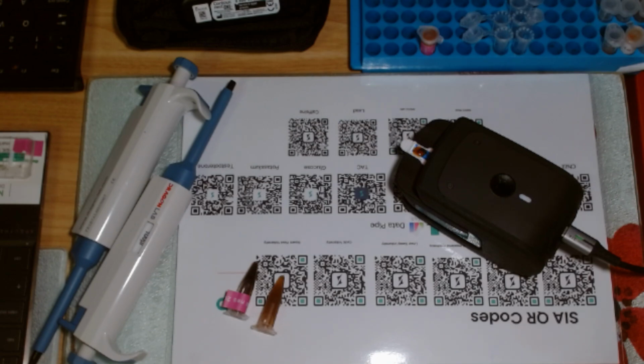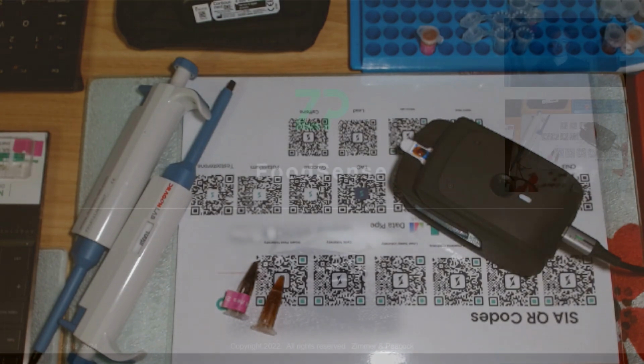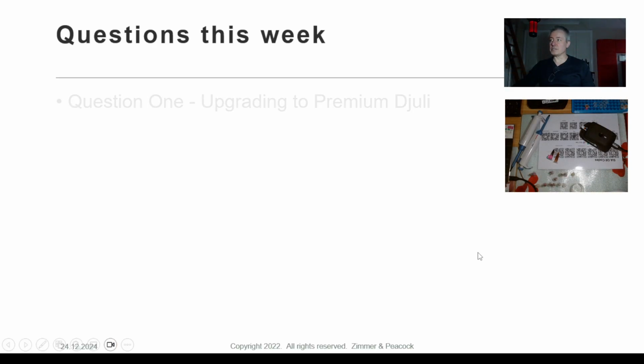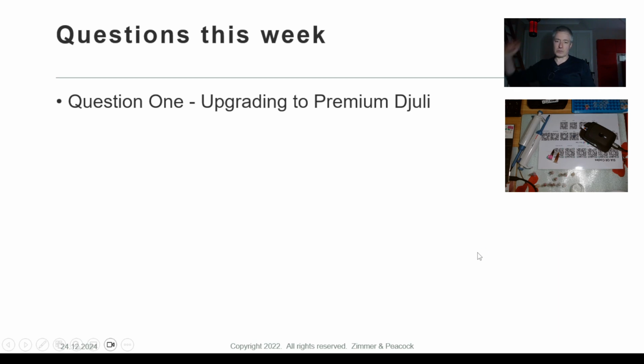Now what I want to do is just quickly jump back to the slides here. We're talking about FoodSense. There will be some real work going on here. Just a couple of comments. This weekly webinar is basically a free support that we provide to users of FoodSense. This week I'll be dealing with caffeine and with capsaicin. And if you've got technical questions and you're a user of the system, then we're here to help.